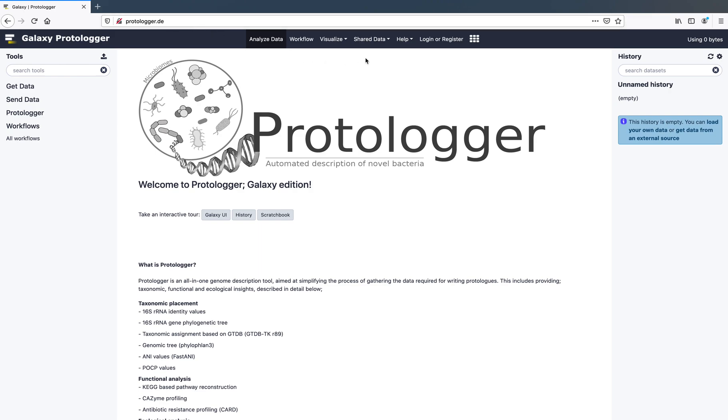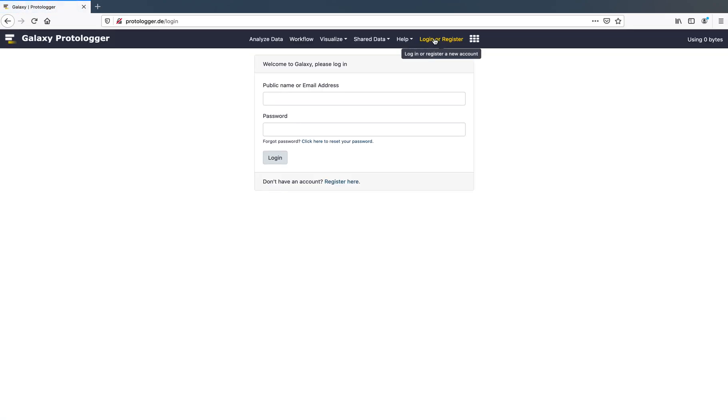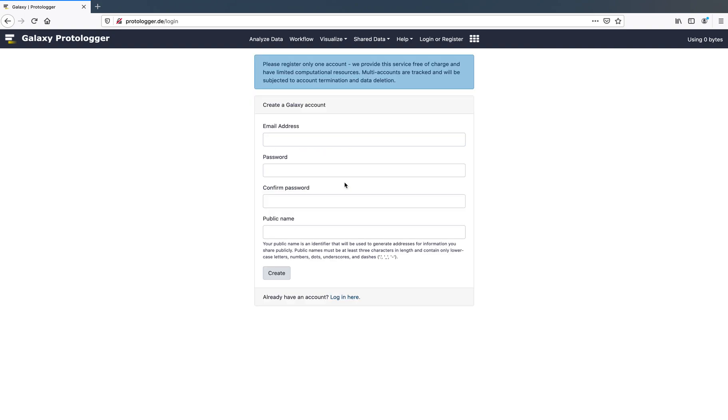An account can be made by clicking the Login or Register button at the top. Next click Register here. Enter your details and click Create and your account will be generated. For this example, we will run the analysis without logging in.